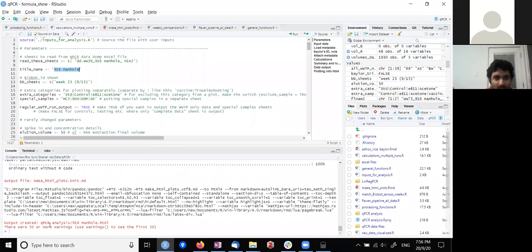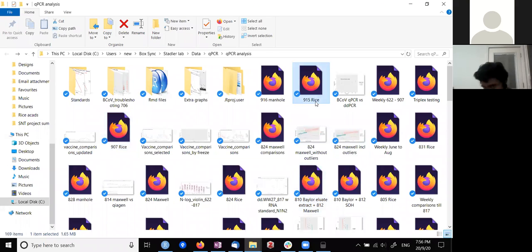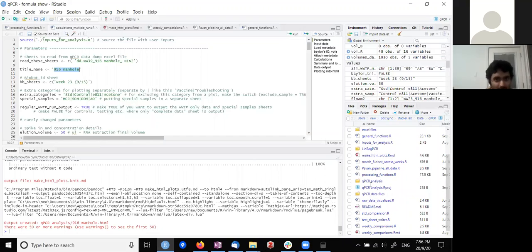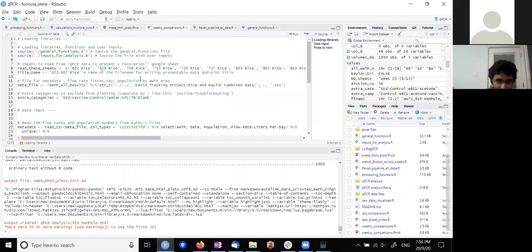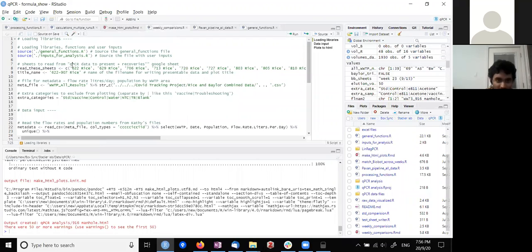And there's another thing which I haven't run for this week, I think. So we can run it right now. Once you get this data, this is the data for one particular week. But if you wanted to compare the data across weeks, you would run another script called weeklycomparisons.r. Here I have a long running string. It has the names of all of the things that you want to include in this data file.